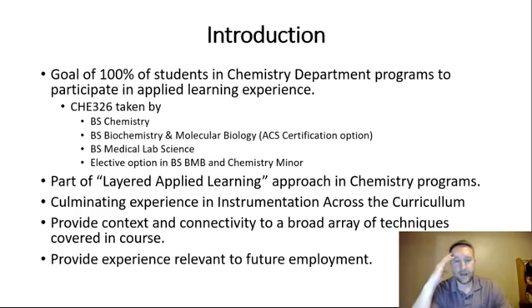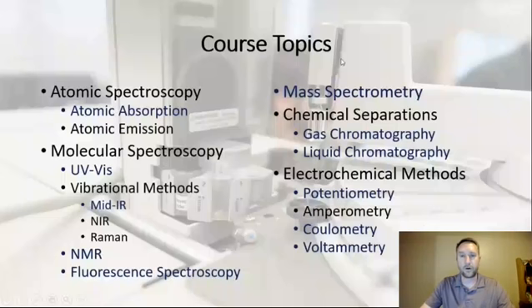The really exciting part of this idea of having a thematic approach is that it provides context and connectivity to this huge broad array of techniques that we cover in the course. And I'm going to show you an example of all of the topics that we have to cover in this particular course. And then, of course, very importantly, it provides experience that's relevant to future employment. So we don't want students to simply get an exposure to chemical instrumentation. We want them to be able to use chemical instrumentation when they get out into the workforce.